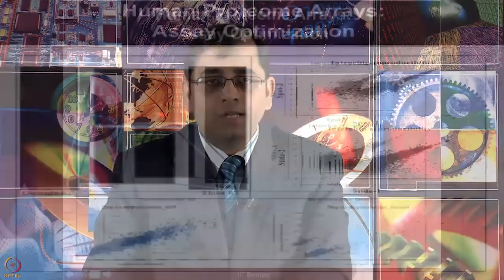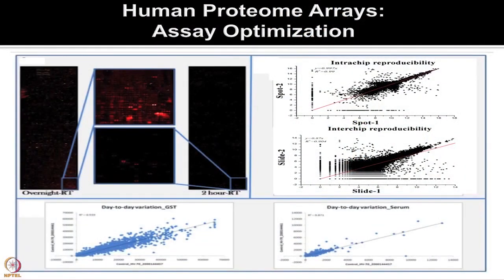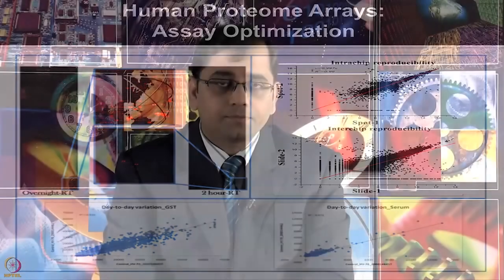So, now we are looking at autoantibody responses, and there should be a response which we want to detect, but it should not be everywhere, which is non-specific. The middle top panel shows that there are a lot of red signals coming non-specifically throughout the slide. The bottom panel looks pretty much clear, everything is not lighting up, only a few spots show red signal, and that is with the shorter incubation at room temperature. So, these kinds of optimizations are very much required.